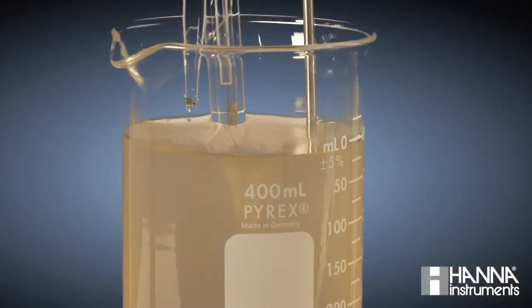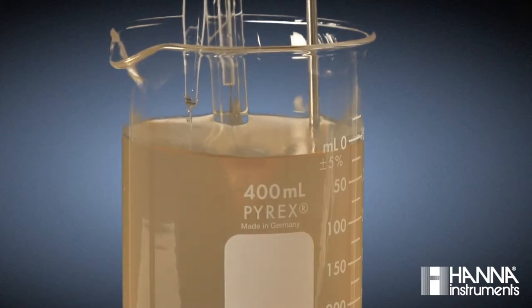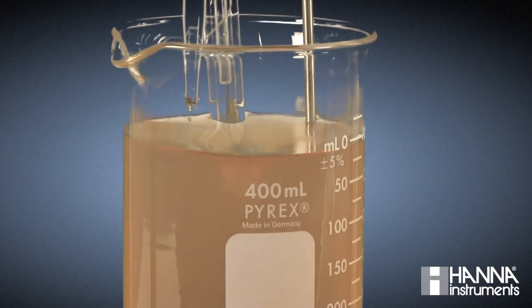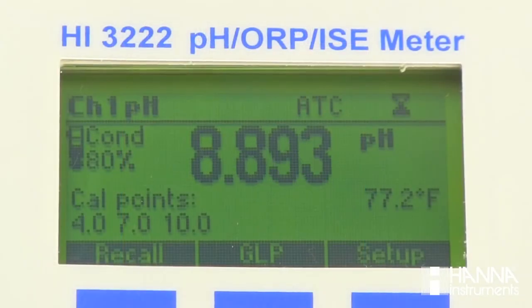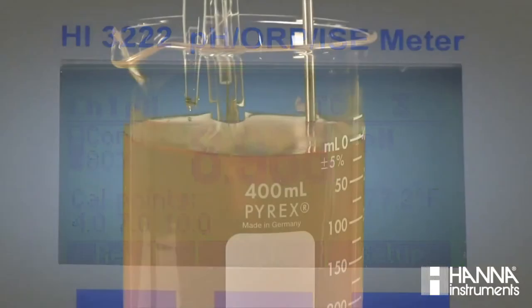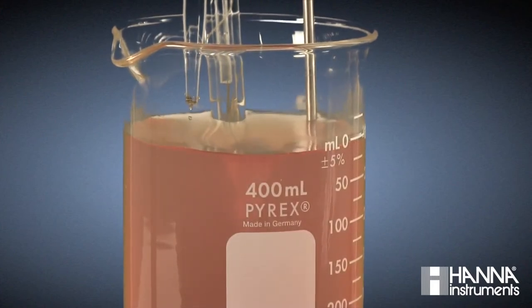You may have noticed that the color change is slightly hard to see, especially because of the colored matrix of the orange juice. This is where having a pH electrode and pH meter instead can be an advantage. If we dose additional titrant and go past our endpoint, our pH begins to change again and our color becomes very vibrant. If a titration gets to this point, the endpoint has been overshot and our concentration of the analyte will be overestimated.